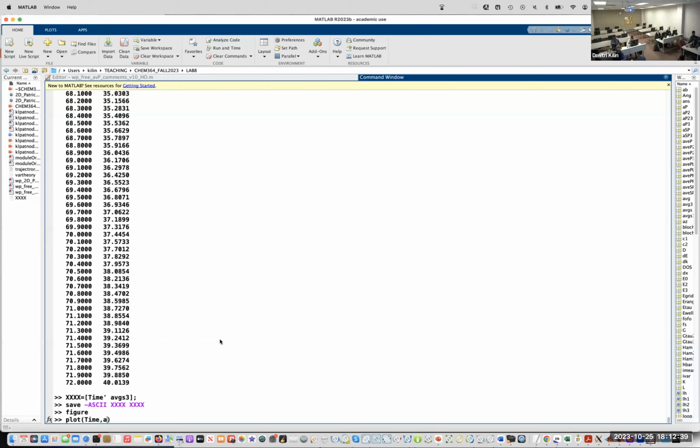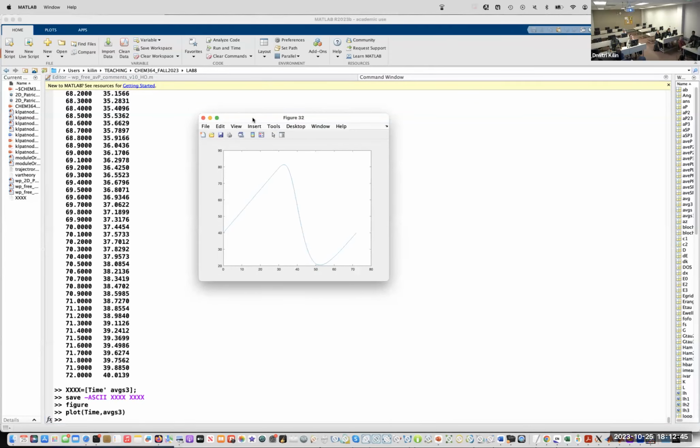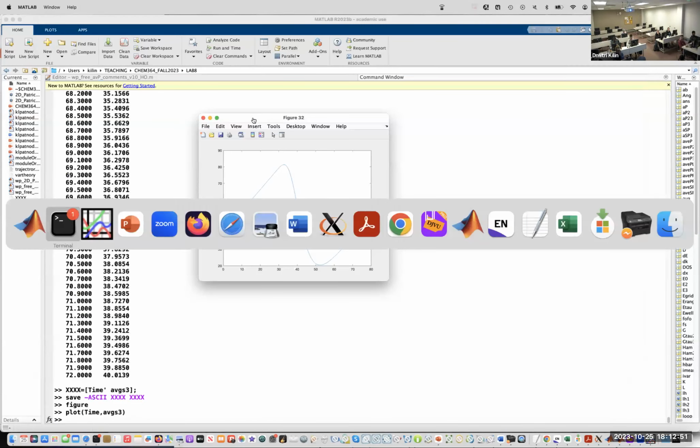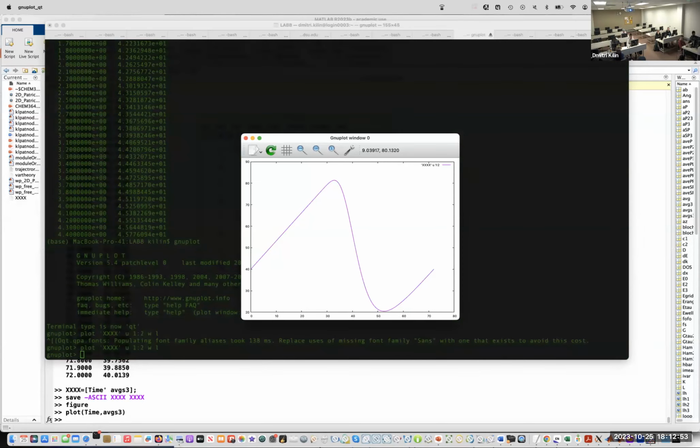AVGS3. So here is what MATLAB is doing, and here is what the third party software does. So we can export the data. Yes. And that was the terminal command that you used? You need to install GNU-plot through Brew or any tool to mimic Linux. You need to connect and install additional software, or one can find GNU-plot online and then download and install.